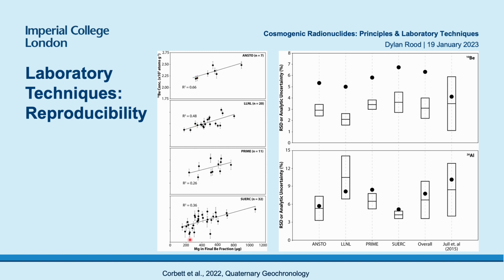This is showing the measured concentration, and you can see here again, this is 10 to the 5th atoms. This is 2 orders of magnitude higher concentration than anything you would measure on a coastal sample. This is the typical kind of range you'd measure normally in these applications, other places at least. And so what you can see here is that across many different laboratories and many different AMS facilities, there is this strong correlation between the content of magnesium and the measured concentration.